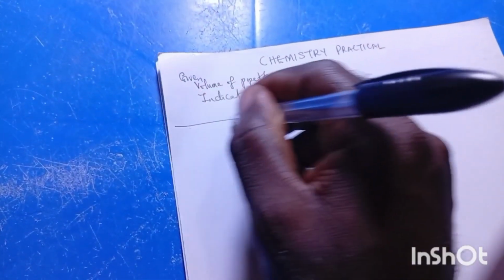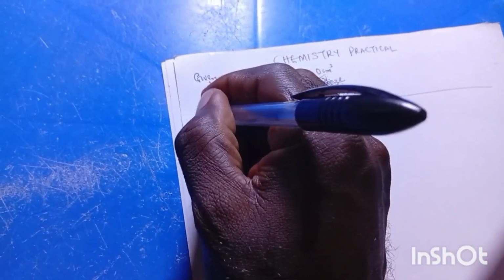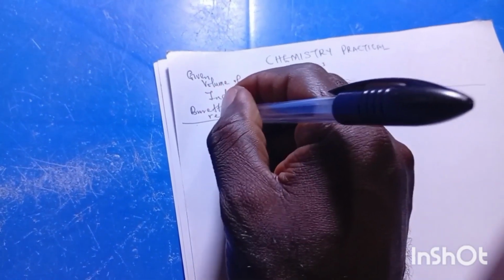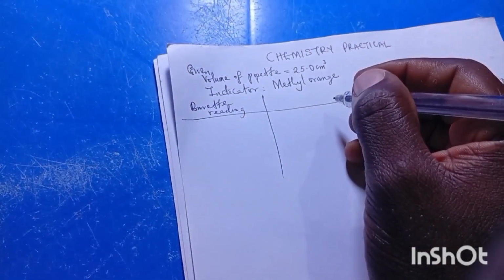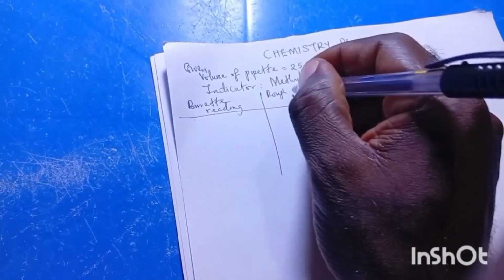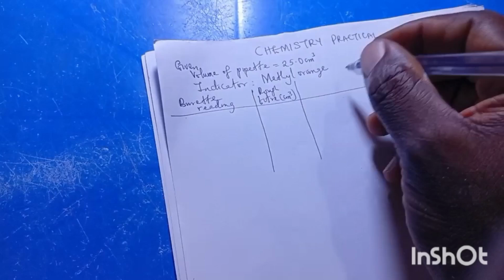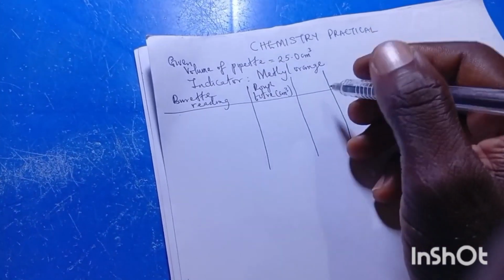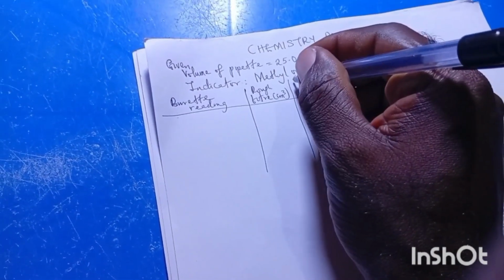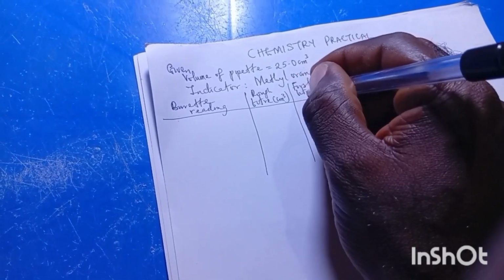Now let me draw my table. Remember, I've told you I'm using 22.6. So I will say burette reading. I will have my rough titre. This time around I want to use 2 titre. In the last video I used 3, but this time let me use 2. You can use 2, you can use 3, depends on how much time you have.